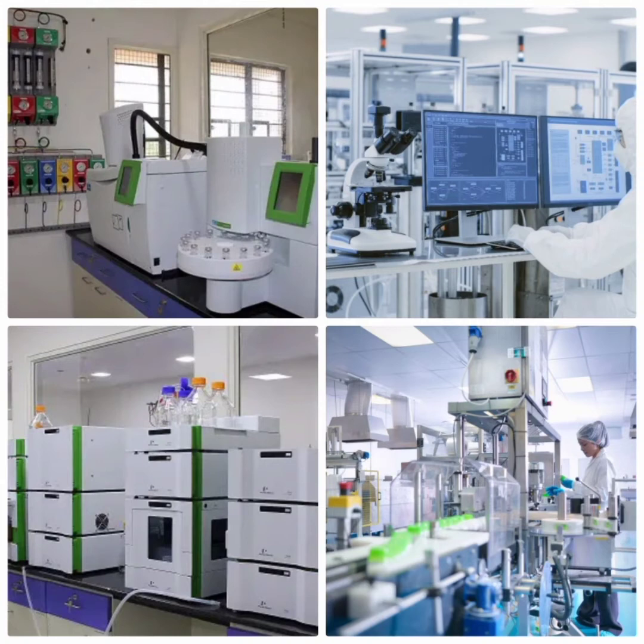It can sometimes be tricky to choose one over the other, but knowing what differentiates HPLC and GC can definitely help with the process. So let us highlight some of those differences and similarities for you.